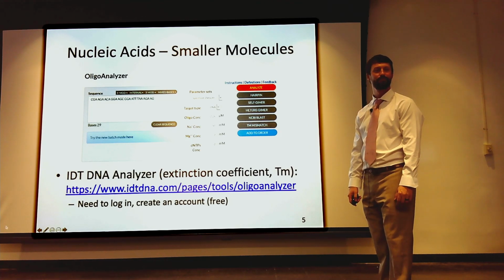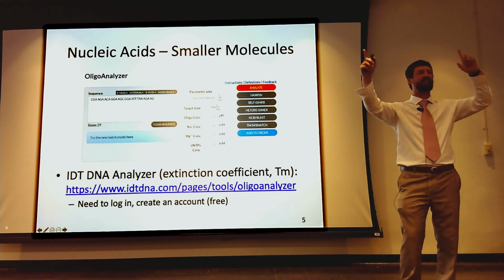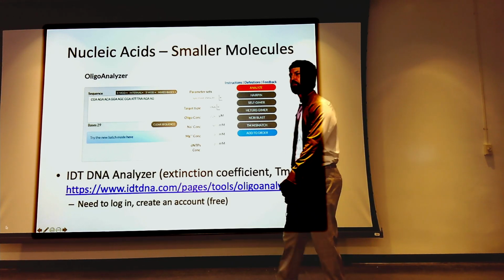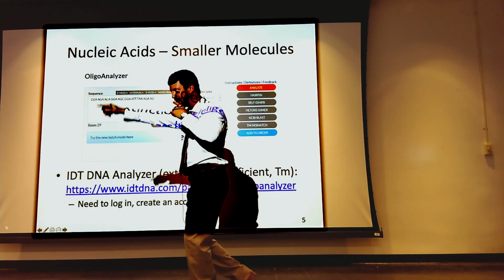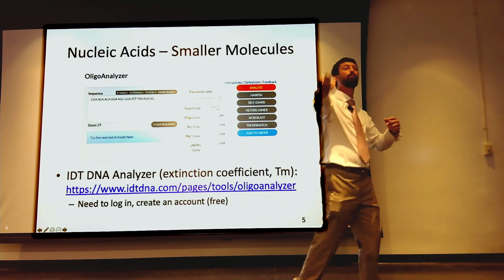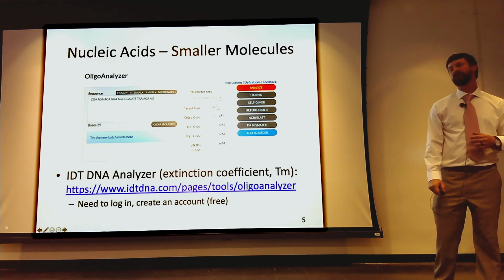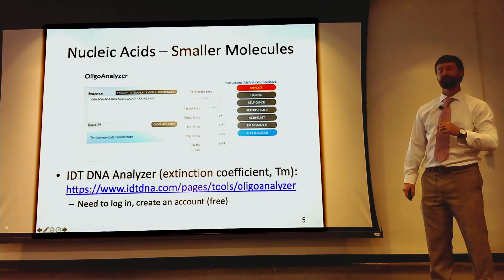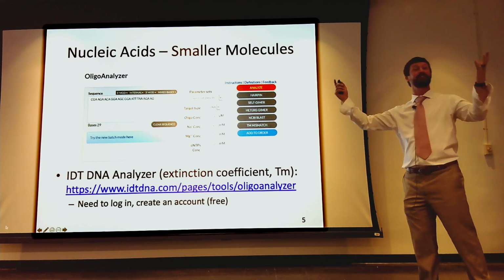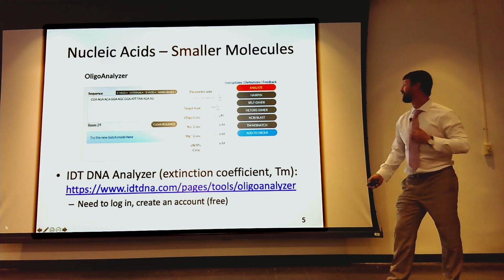If you design your primer so you get a hairpin, will you make your mutation? No. For those who aren't familiar with quick change, we take a small piece of DNA, we use it as tape. We make a specific intentional mismatch in it. We lay it down on top of the plasmid, we anneal it, and we have an enzyme come along, and when it hits that bubble, it actually incorporates the wrong amino acid on purpose, right? If you're doing quick change, use an enzyme that doesn't have proofreading capabilities, right? If you have proofreading capabilities, it'll fix the error, not make your mutation. Anyway, things that'll come back to bite you.